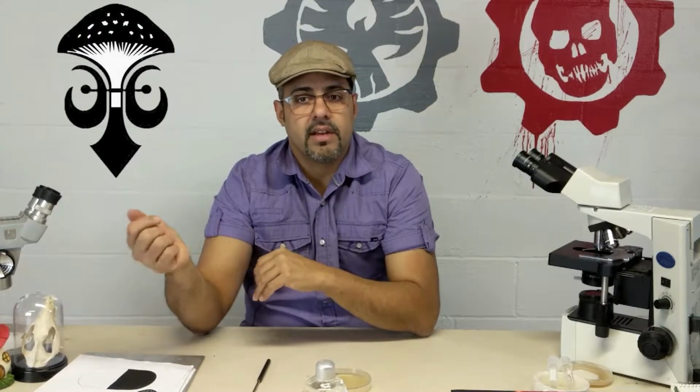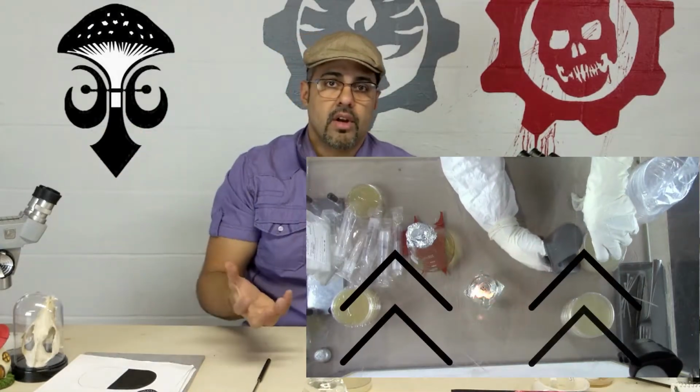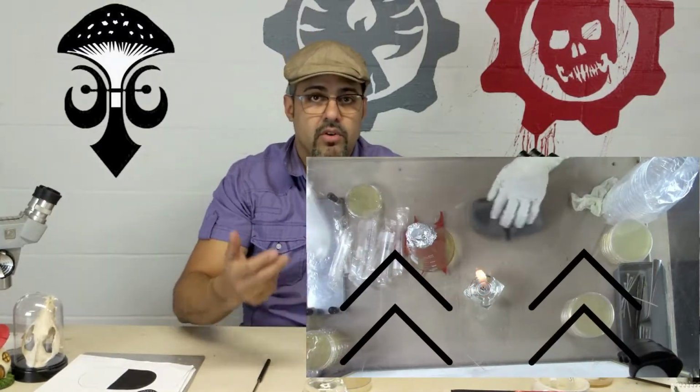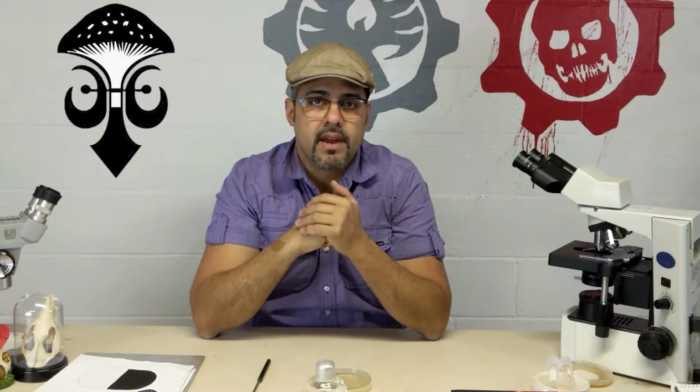One of the most important things is to have a Bunsen burner. Okay, so if we don't have a biosafety cabinet, which pretty much is a clean environment, that probably some of them have either HEPA filters like the biosafety cabinet, or a laminar flow booth, which pretty much is to push the air from one source to the other. So it's either from one side to the other, or laminar flow can be from top to the bottom, or from the back to the front. I'm going to show you my homemade laminar flow booth in a second.